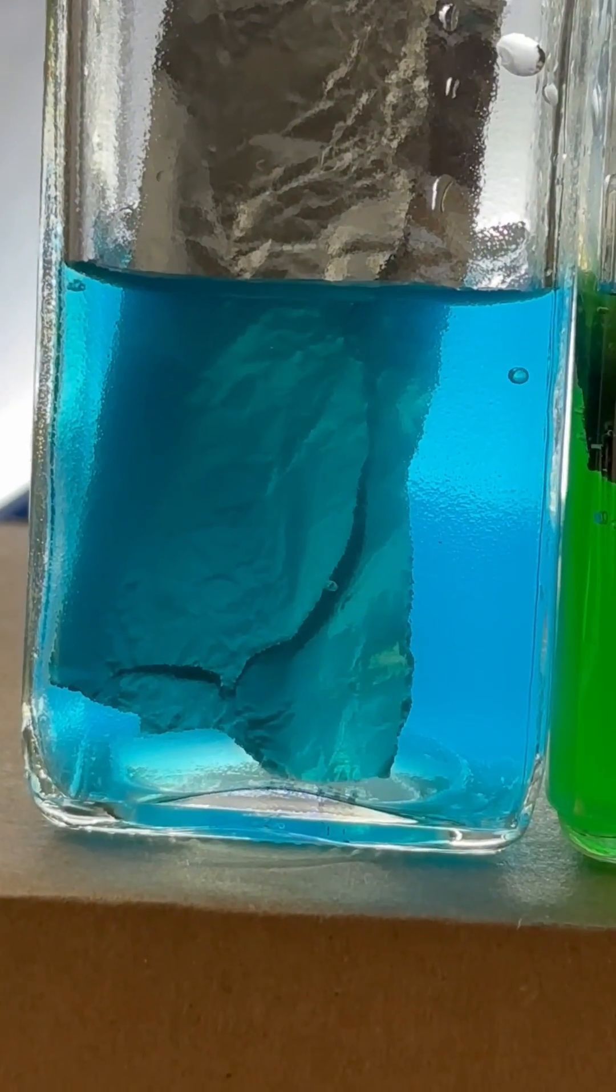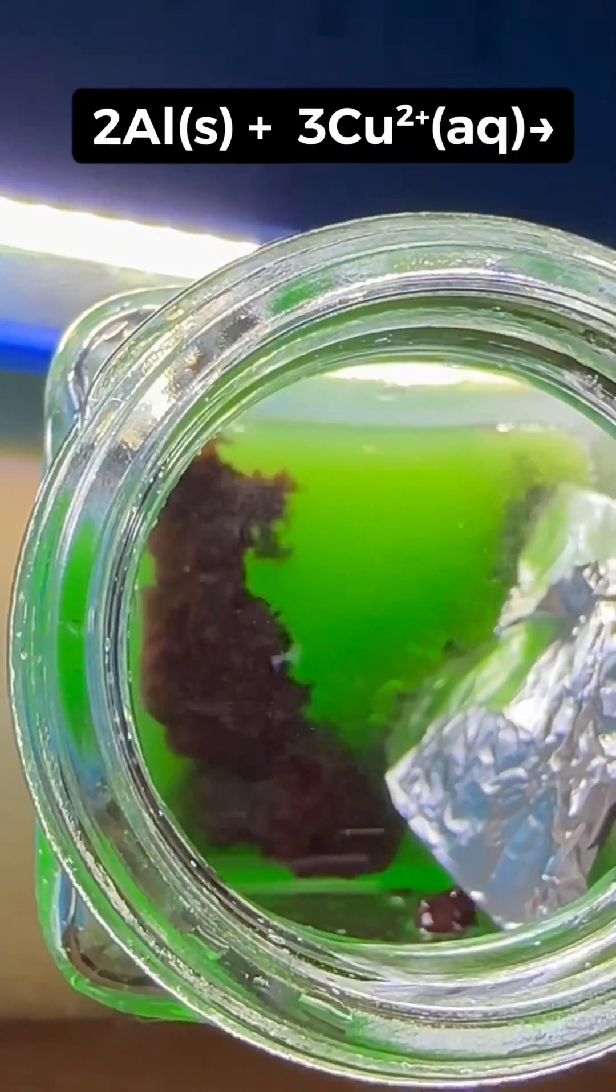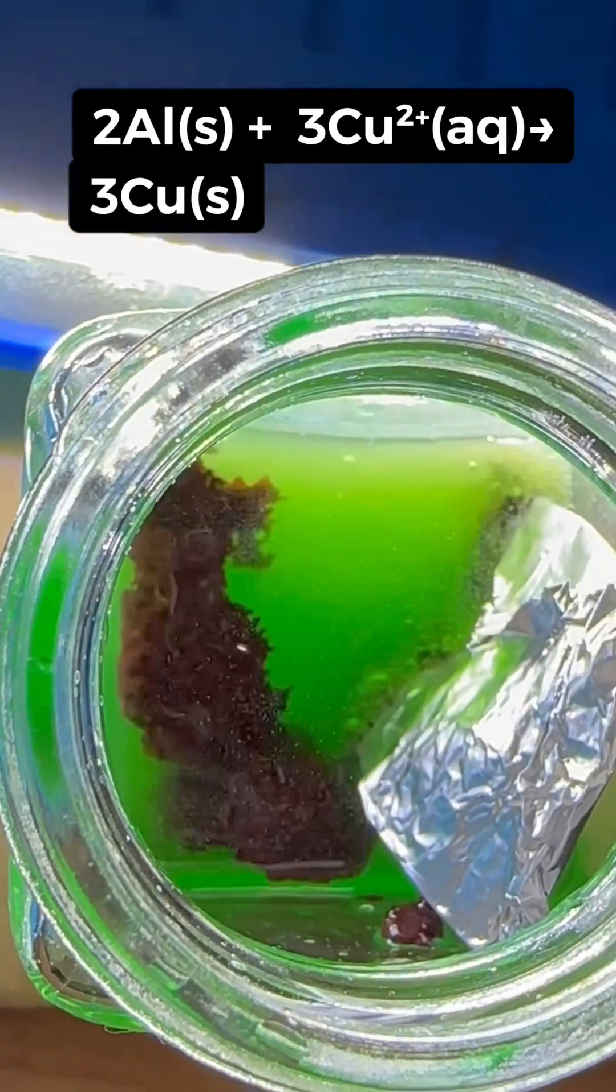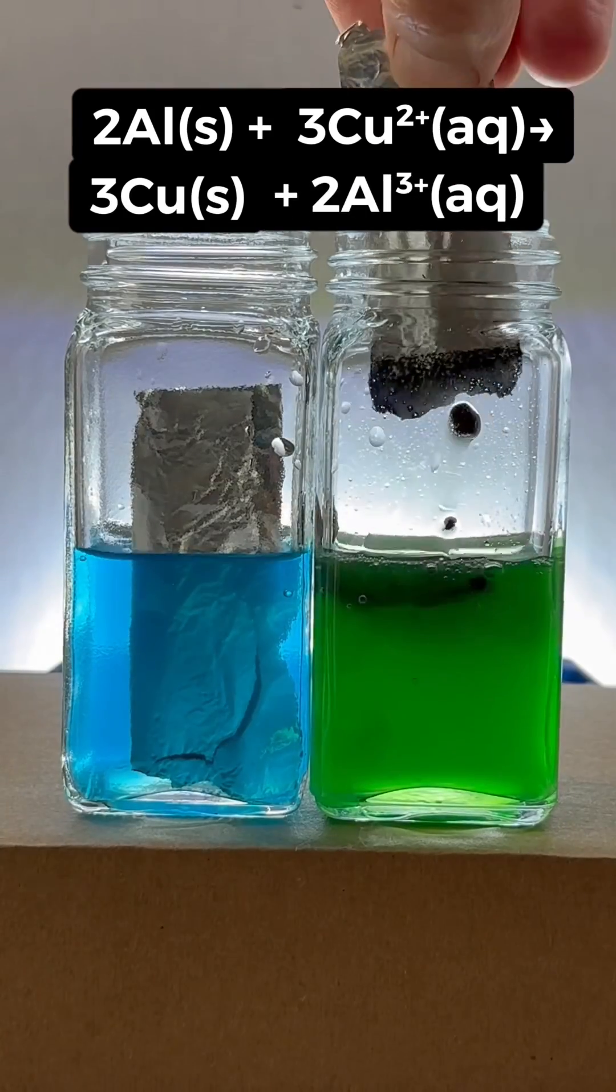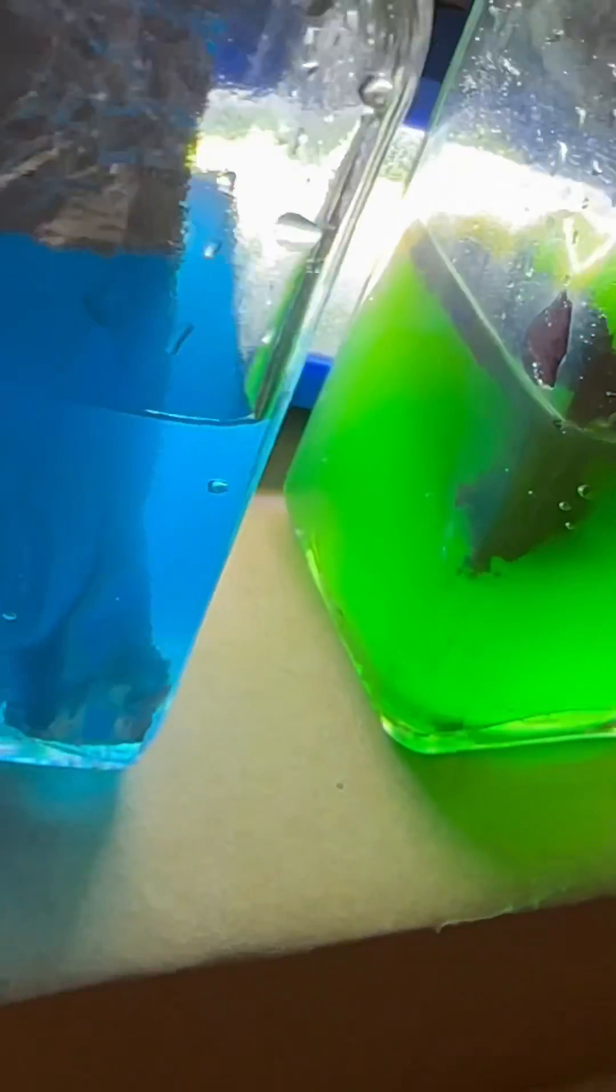But nothing's happened in the copper solution that doesn't contain salt. Aluminum metal will react with copper ions in solution to produce copper metal, and this process dissolves the aluminum. But it's pretty clear this same reaction doesn't happen in the copper solution that does not contain salt.